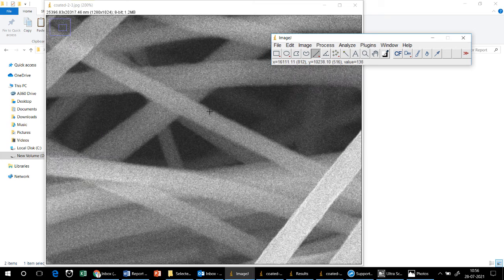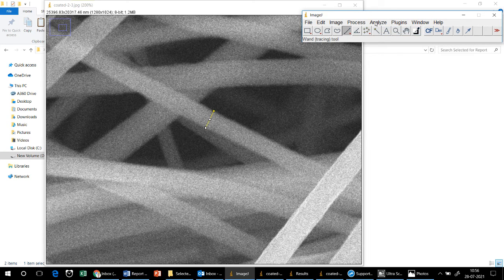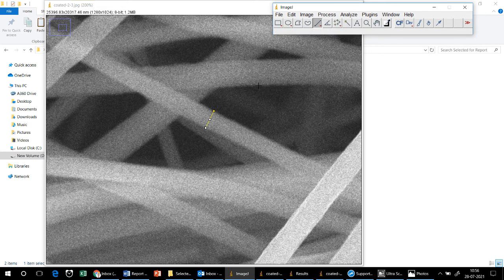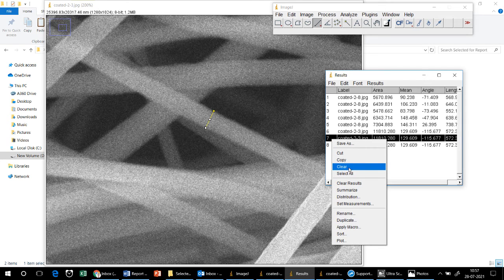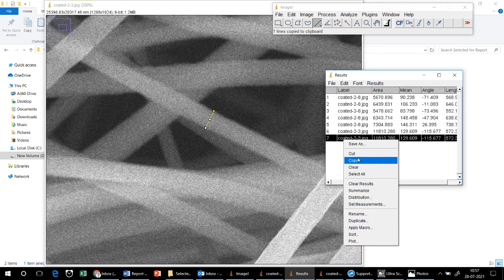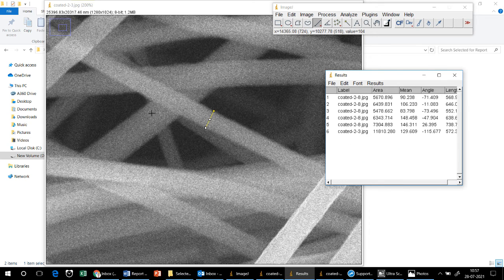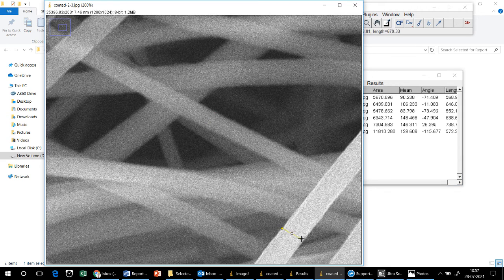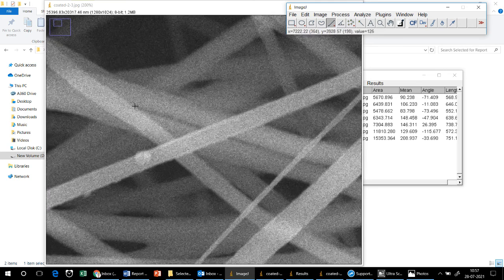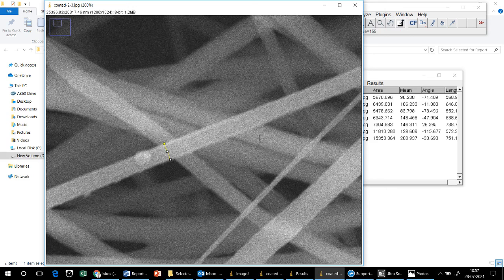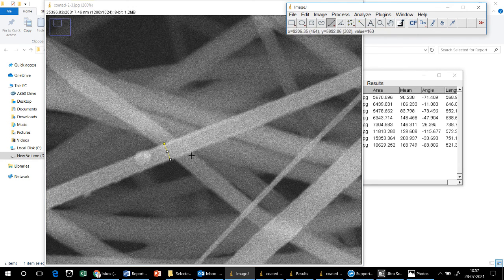Now I will measure the diameter of different fibers on this image using the same procedure: draw a line across a fiber and click Measure. One fiber gives 572 nanometers, another gives 751 nanometers. In this way you can measure the diameters of as many fibers as needed.